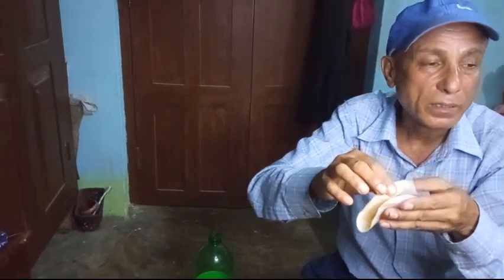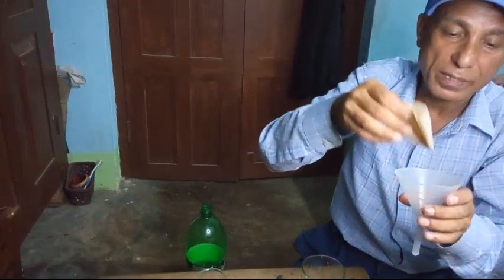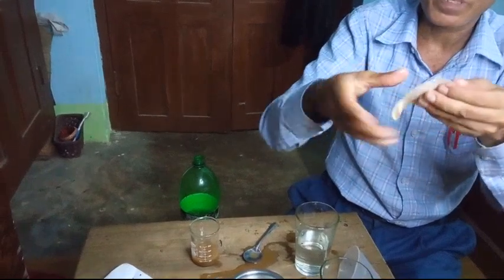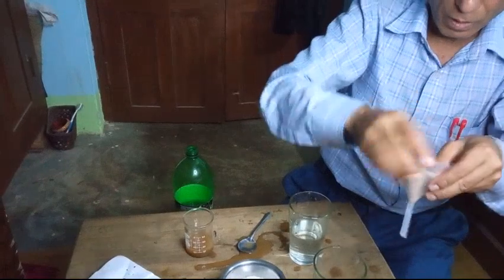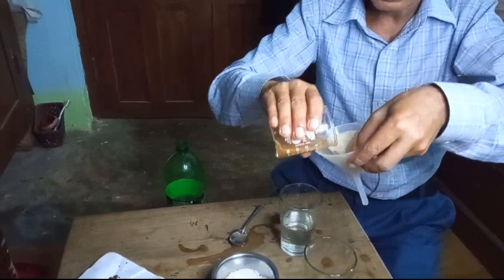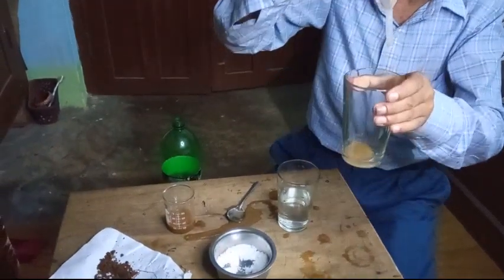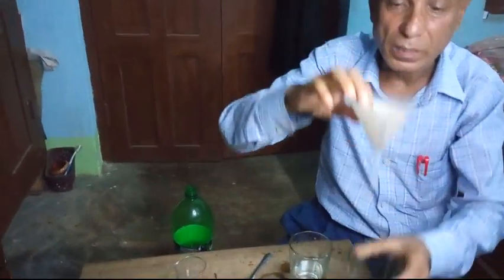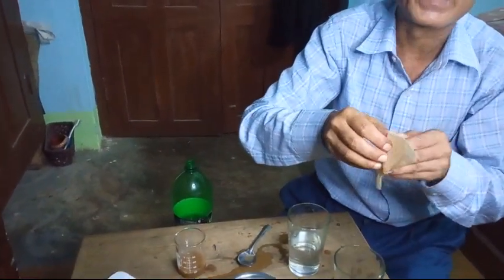In this way, you can separate soil and water very easily. Again, take a funnel, take a filter paper, fold it, and again pour the heterogeneous mixture, and you will get the liquid. But you have to do this experiment slowly to get a pure liquid. The pure liquid is called filtrate. The insoluble solid particle left on the filter paper is called residue.